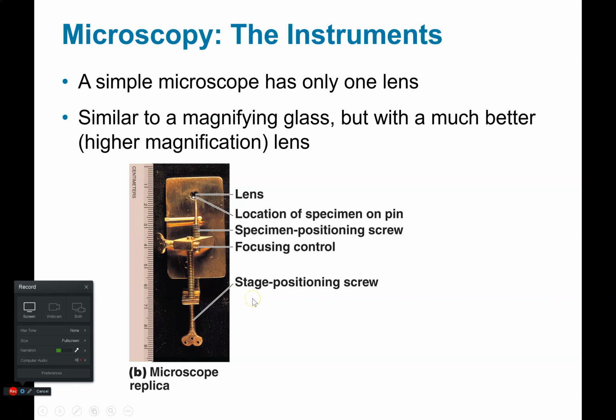If you watched one of the videos that I had in chapter 1, then you saw this microscope already when they talked about Van Leeuwenhoek and how he made his own very simple microscope, and was able to see a lot of things that no one had ever seen before, including bacteria. So even though it's a very simple microscope, it was effective and did allow for viewing bacteria.